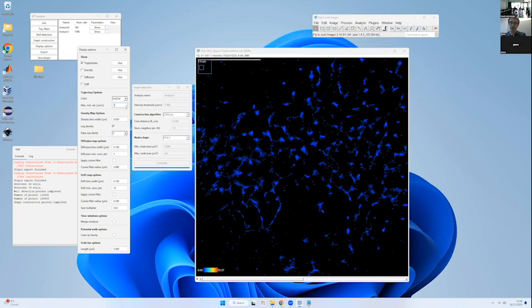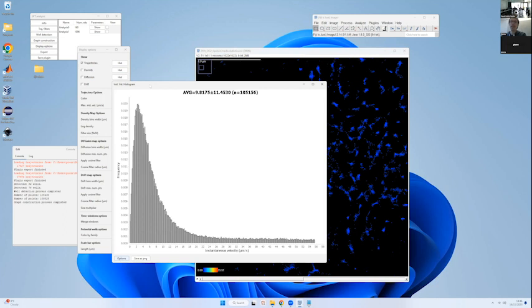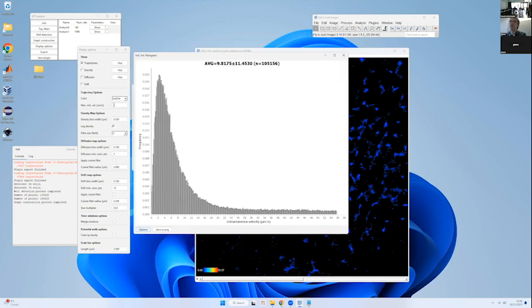How can you define a threshold? You can look at your distribution, because you have your histogram of distribution. That's what you did in the first part. When we set a threshold in the interface, we basically remove everything that's above 5 in this histogram, and we keep only the rest. But you don't have the delta X distribution for the grid.